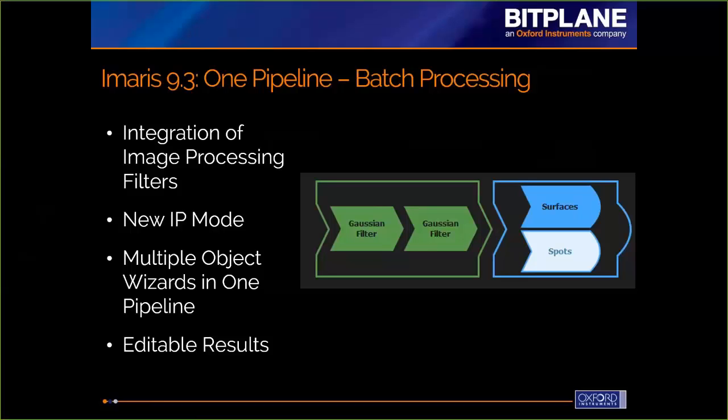So when you go to actually run a batch process, you just say run batch, and you do it once, and it works with all of those images within your folder. It's there to make your life a lot easier and a lot faster, so that you can do the most amount of work staying within Imaris as possible, so you don't have the extra work and the extra thought to go back and forth between different programs.